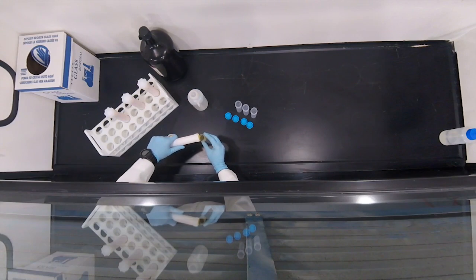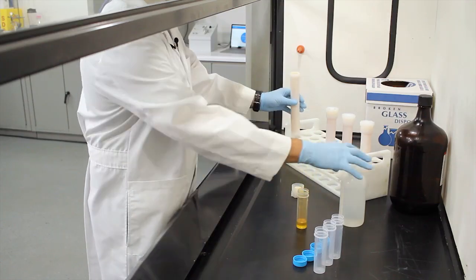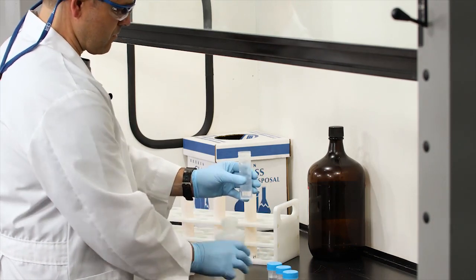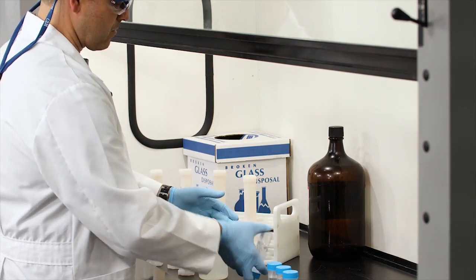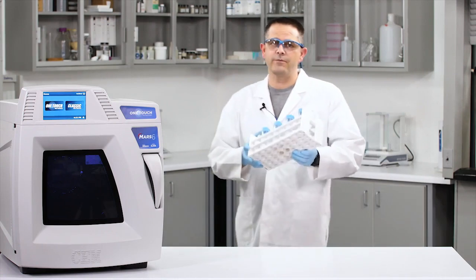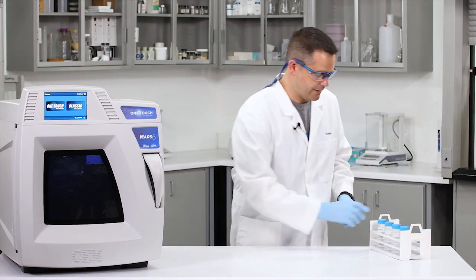Here is sample 1. And sample 4. Well, all of our samples have been diluted. Let's take a look and see how well we did.